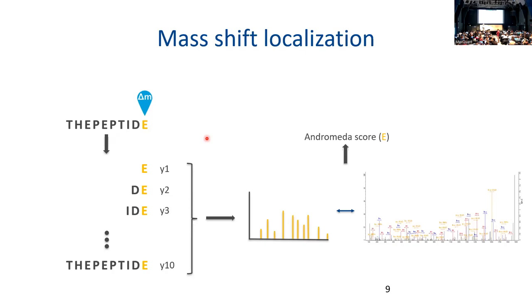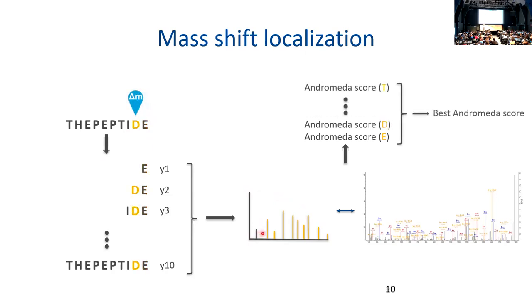Okay, so this stage identifies not only the modification, but also the localization. Yes, so two in one step. Okay, thank you, good to understand. And I hope this moment is understandable: the initial spectrum is taken from the identified search space, and then different parts of the spectrum are shifted depending on which amino acid is modified. So all of those ions here have normal states and shifted states throughout this algorithm.